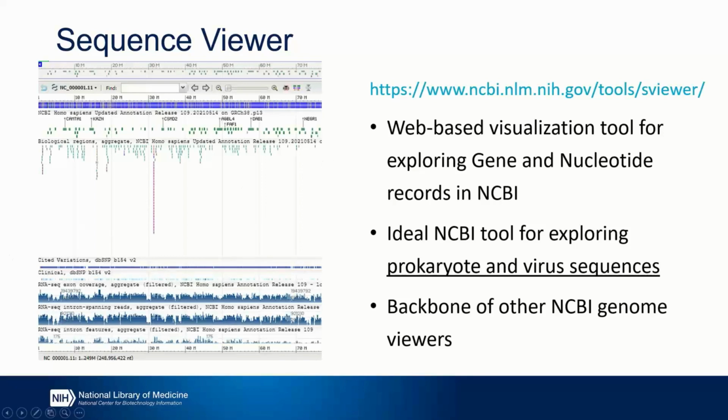Now, the Sequence Viewer itself is actually the backbone of all other NCBI genome viewers. For example, during the live demonstration today, I'll be using a different tool, which I'll be talking about in a few moments. But in reality, almost all of the features in that demonstration are really built inside Sequence Viewer. So even after this talk, if you find yourself using a different visualization tool, the odds are pretty good that you'll be comfortable with using the Sequence Viewer anyway. And similarly, if you are already coming into this with some experience using the Sequence Viewer, then moving into some of these other tools I'll talk about next should actually be pretty easy for you.